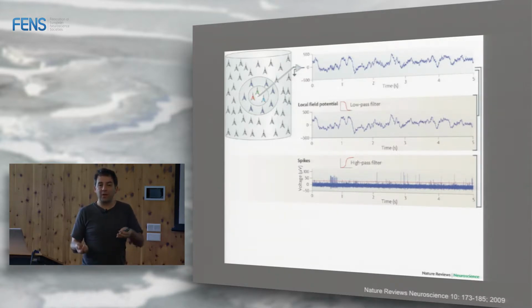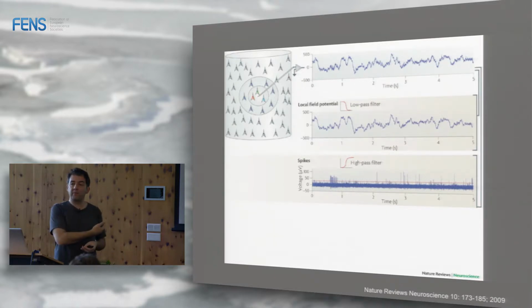That's called actually the cocktail party problem. It's a very well-known problem in mathematics. I mean, like we try to split the voices from one or several microphones. It's a similar problem here. If I record from this microphone, this electrode, and I'm listening the firing to all these neurons, well, I want to know which is which. It is a spike from this one, it is a spike from that one, and so on.